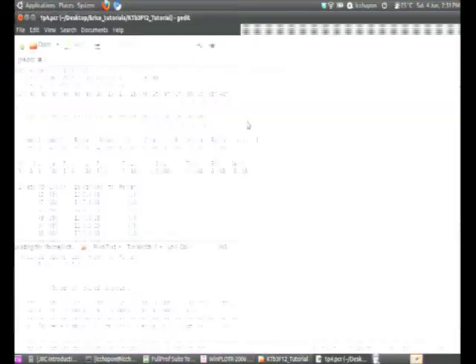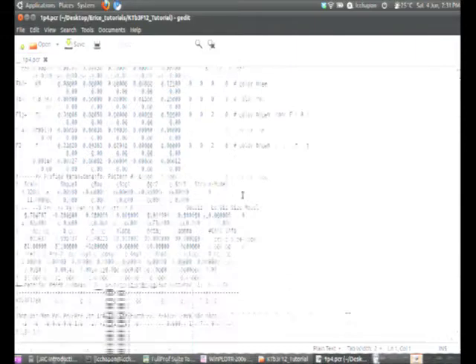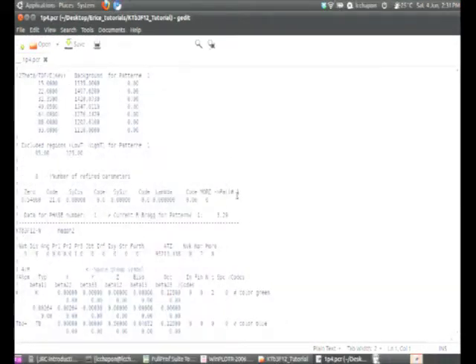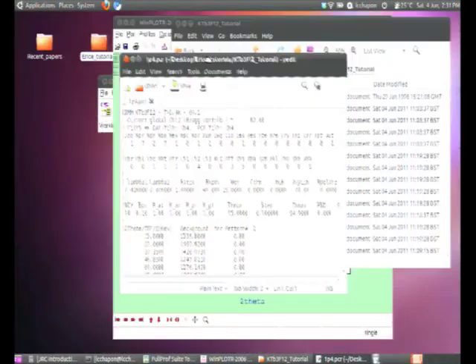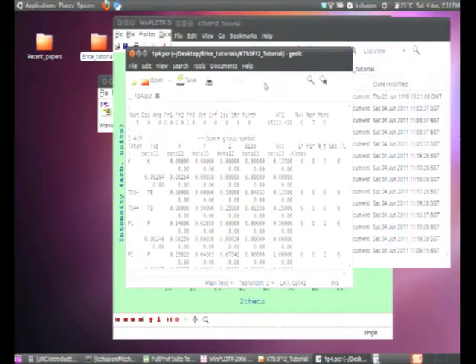So you have an input file. This is essentially an unformatted text file. This is the way FullProf has historically developed. And so you have your data file, which is essentially an ASCII file or some other format. It can be binary as well. But the input file is essentially free format text.